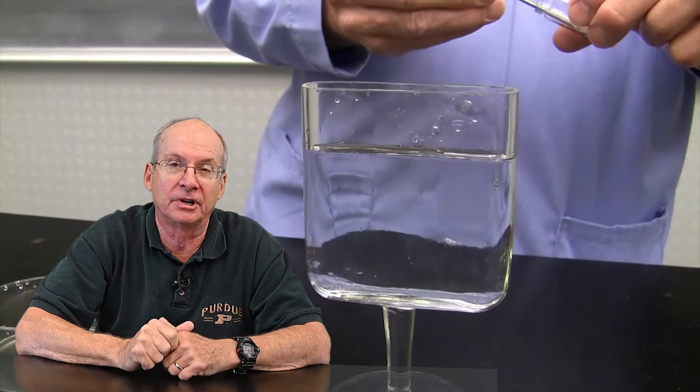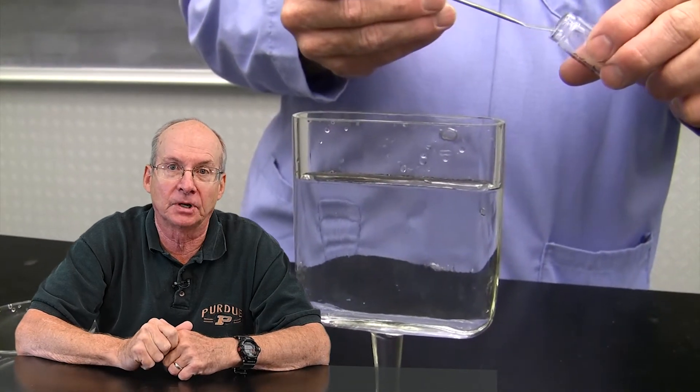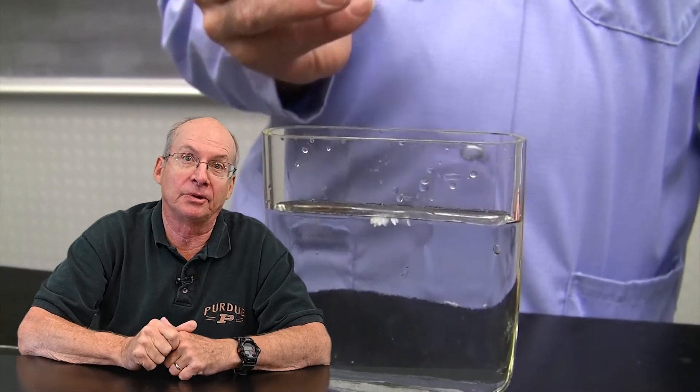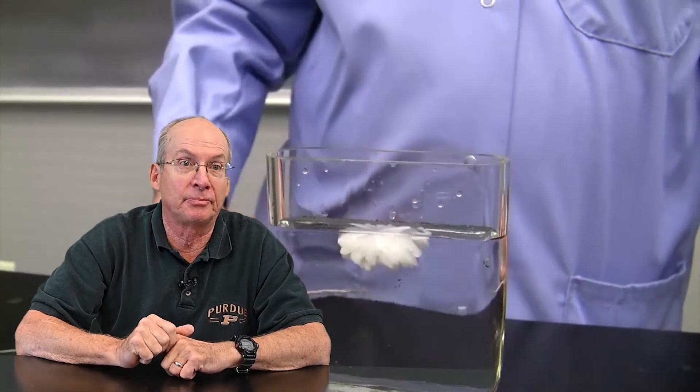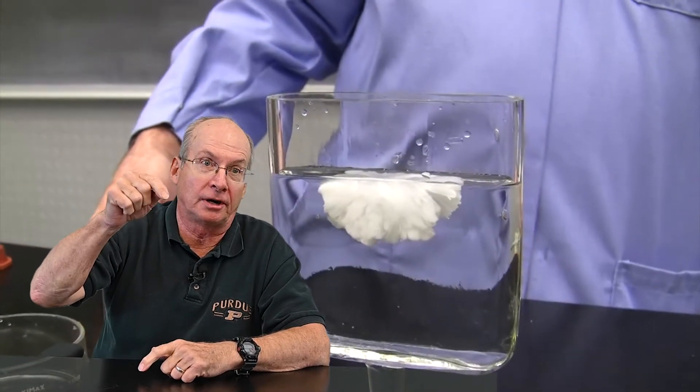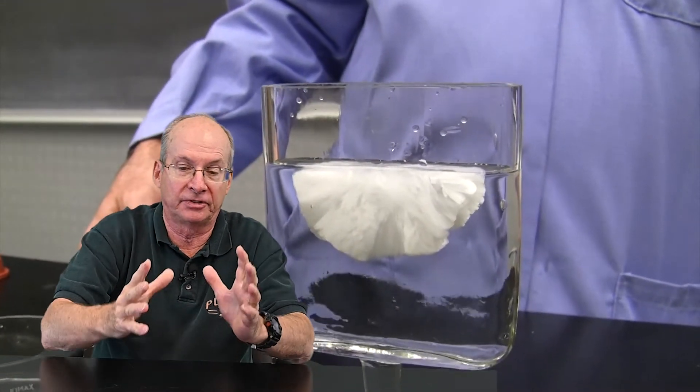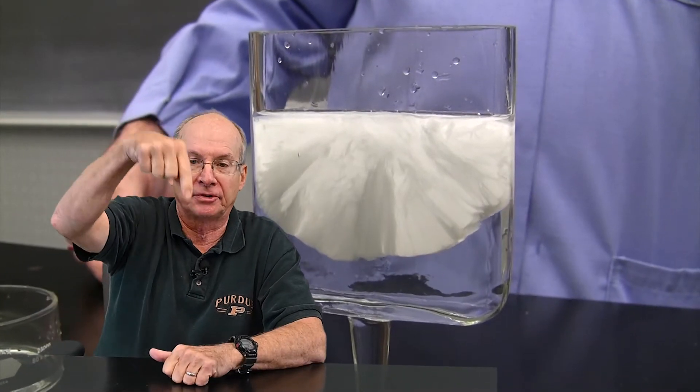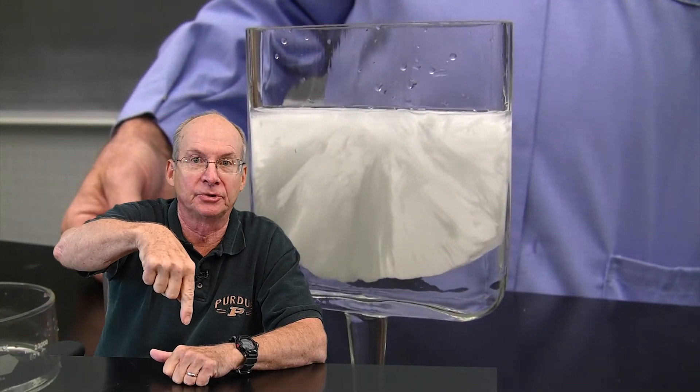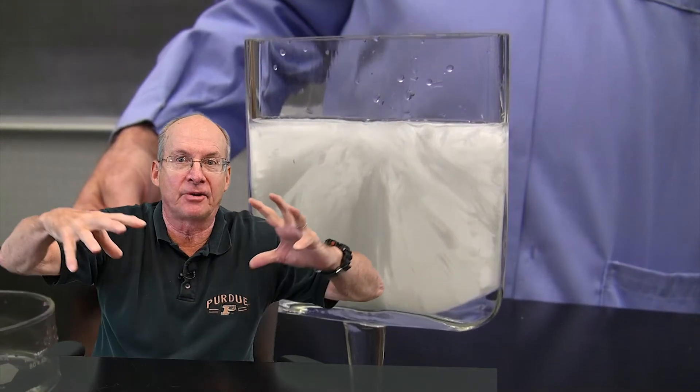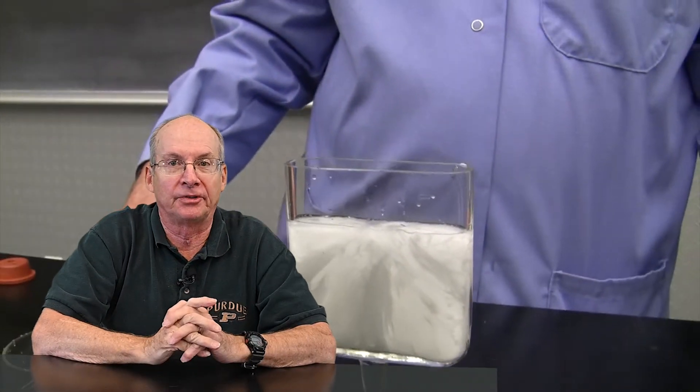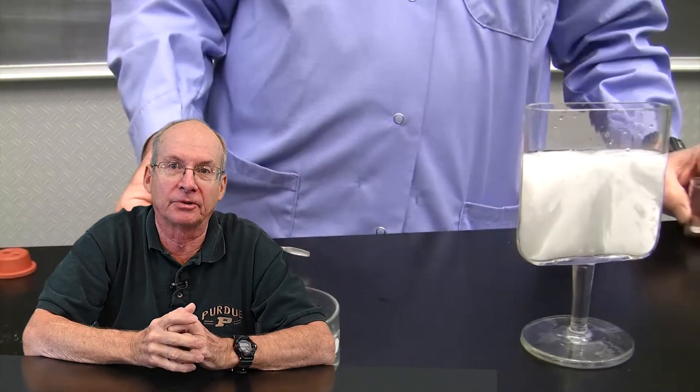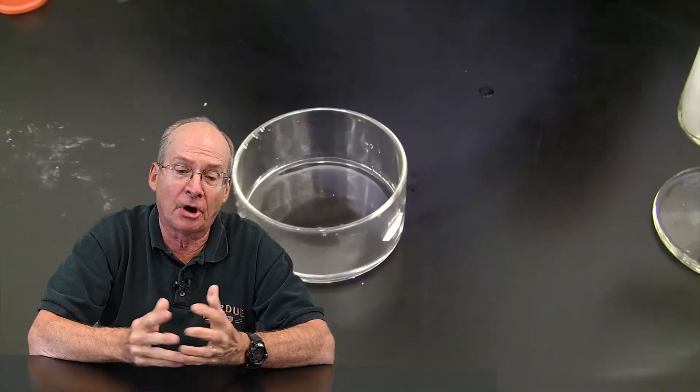There's a number of different ways you can do that. I saw another one that The Big Bang Theory did a pretty good job of. They took and put the crystal on a straw, and the flask, the liquid was down in the flask, and they immersed the crystal into the center of the solution and you saw it radiate out from the straw and the crystal. The whole thing went solid and then of course the straw was frozen there in the crystalline material.